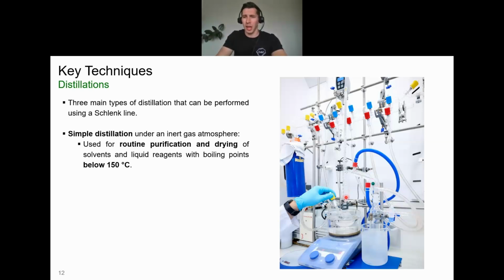Here, even though I'm holding it, this is actually closed so that we don't ever run the risk of the solvent evaporating through this way. It always has to go from hot to cold and be collected here.